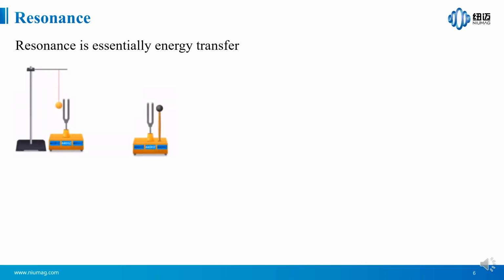The third part is resonance. The essence of resonance is the transfer of energy. Take the tuning fork, for example. Look at the two tuning forks in the picture.